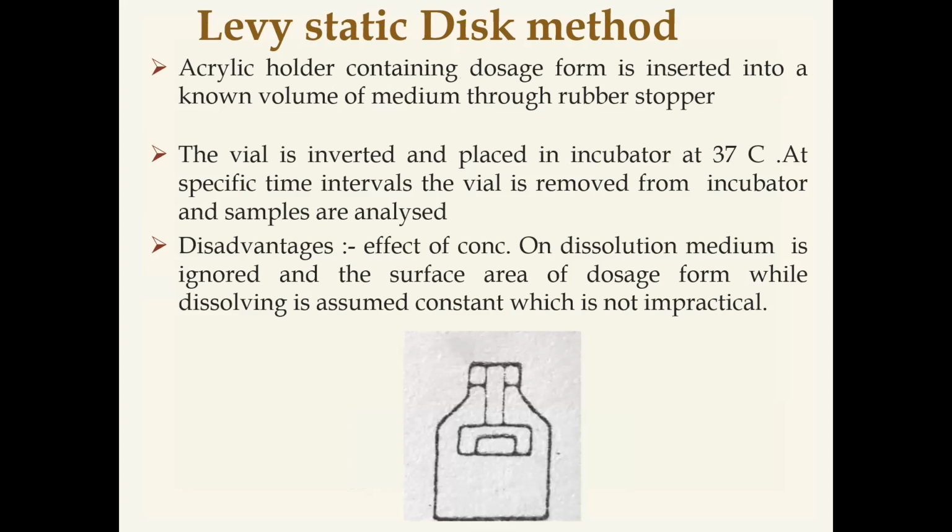Levy static or disk method. The next method is Levy static or disk method. This method was developed by the scientist Levy. It is also called the static version of rotating disk method. This is the figure of Levy static disk method.